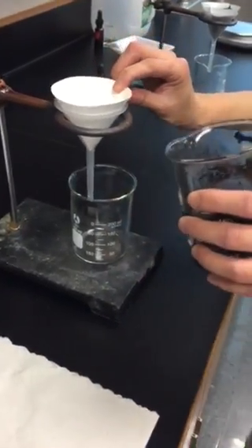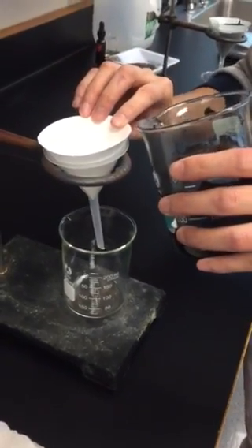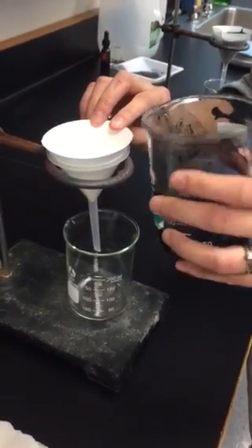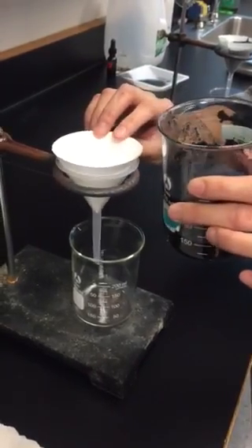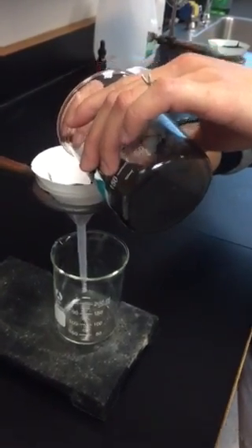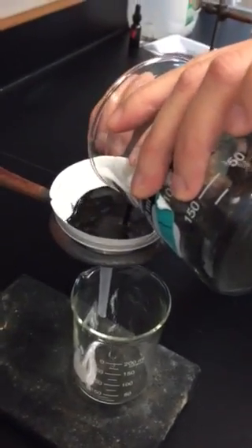Then you're going to add the solution. Please tell the students to pour very carefully because you don't want any overflow. If there's overflow, it's likely that some of the solution is not filtered or the filter paper might collapse. So just add solution to just the top of the filter paper.